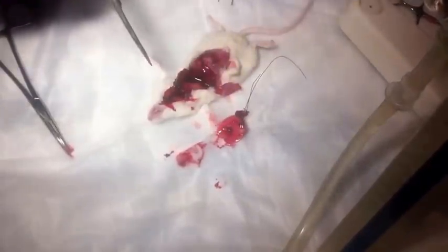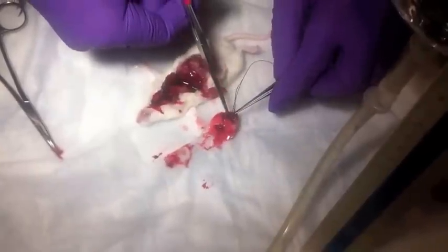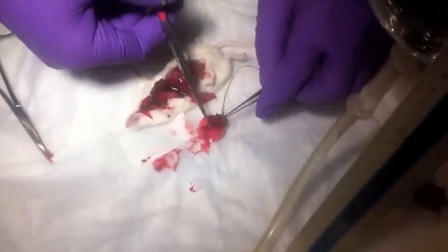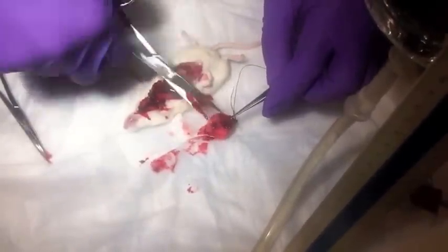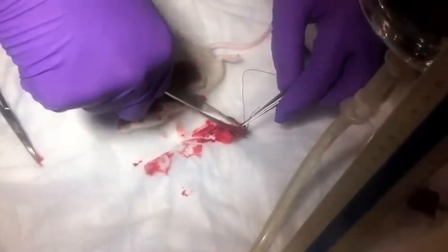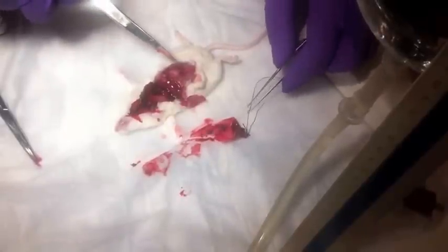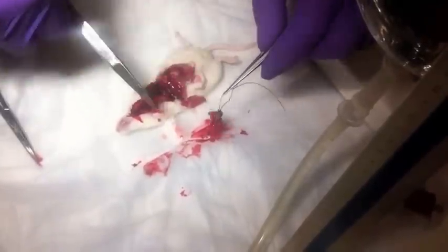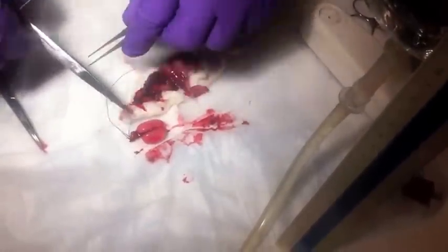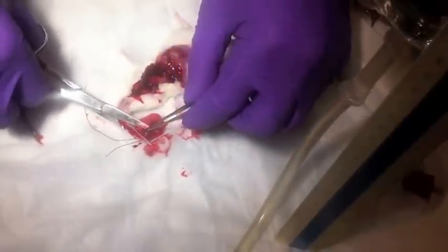Now we need to dissect off the heart. The heart could be taken off in the thorax, but there's generally more blood, so it's easier to do it after you've removed everything from the thorax. Then we can go on the other side and do some more trimming to get rid of the esophagus that's stuck to the trachea.